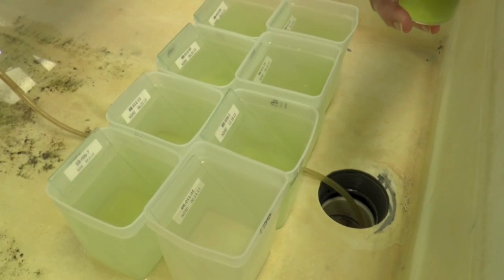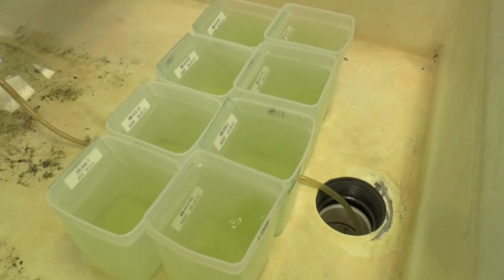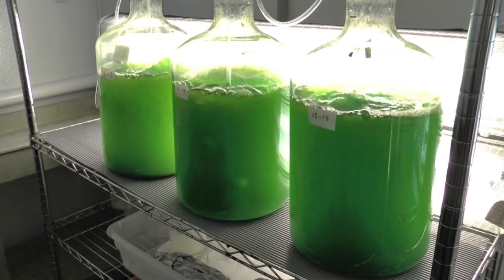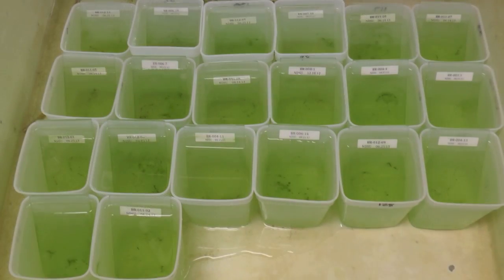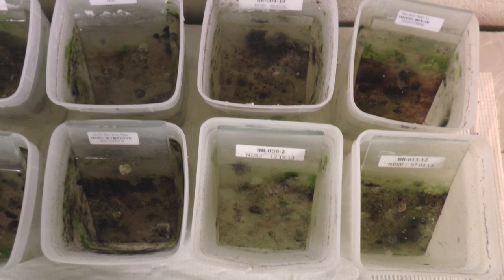Then the panels are placed individually in bins with 700 milliliters of the specially prepared seawater and 40 milliliters of green algae to eat every day. They will grow for 6 weeks before brine shrimp nauplii will be added to their diet. Once the barnacles get big enough, they can be pushed off and reattached anywhere.